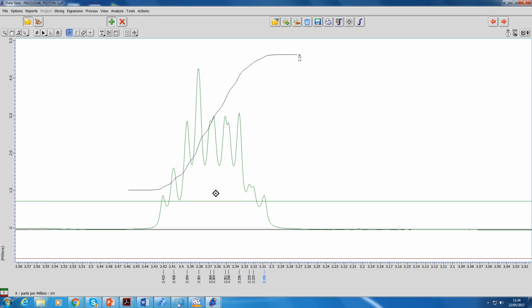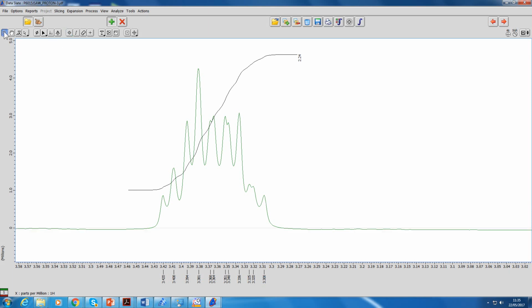I believe if you zoom in further, you've got the green threshold line. If you zoom in further, you get a grey line, which is for noise, which you can also adjust. So at the bottom we've got the black baseline, and just above that there's a light grey one. You have to zoom in very far, just down there, just get the edge.